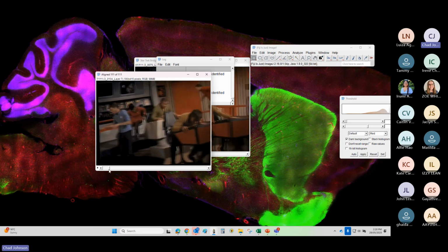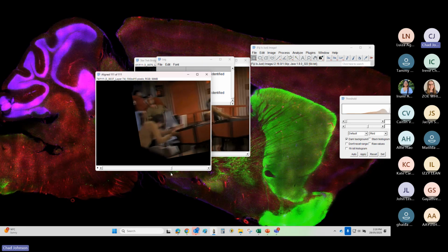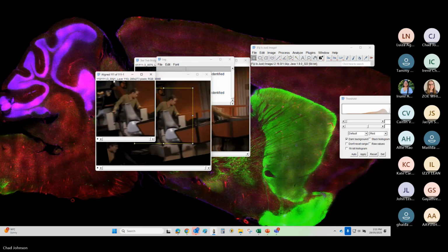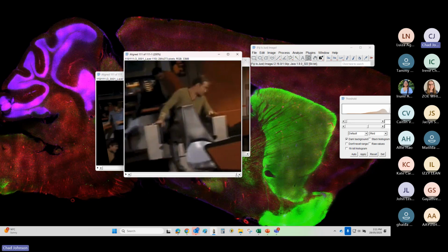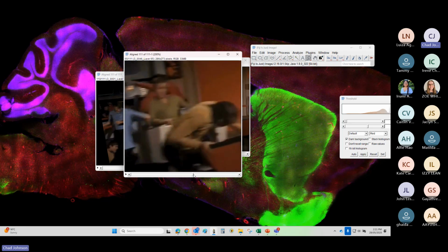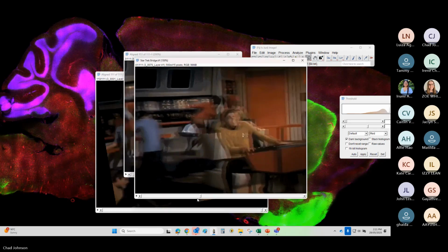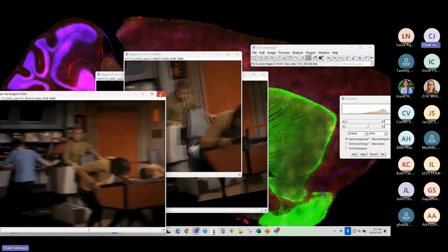Okay, so as I go through, you can actually see that it's aligned it pretty well to where Captain Kirk's sitting. You can see that the image wildly goes off to the side when it pans to the right there. So now, if we segment this based on Captain Kirk, you can see that even though there was a crazy amount of movement, we've pretty much stabilized that as well as we possibly could based on the data set. So yeah, SIFT is a really great functionality.